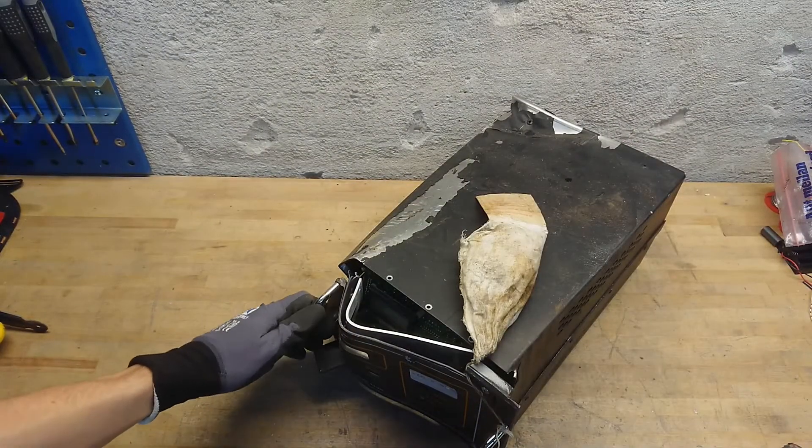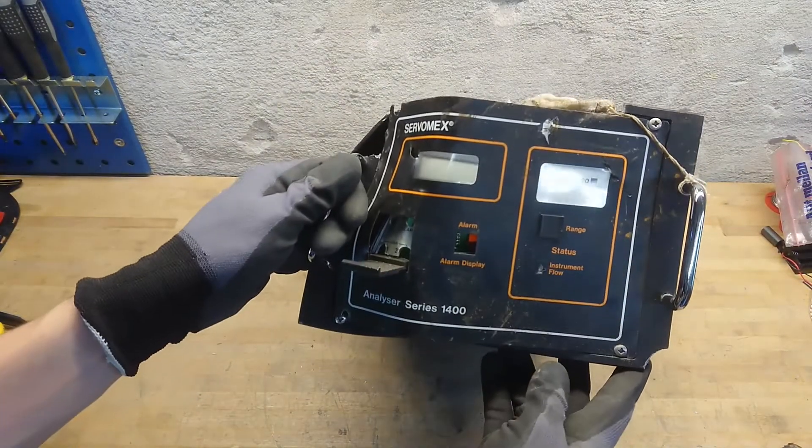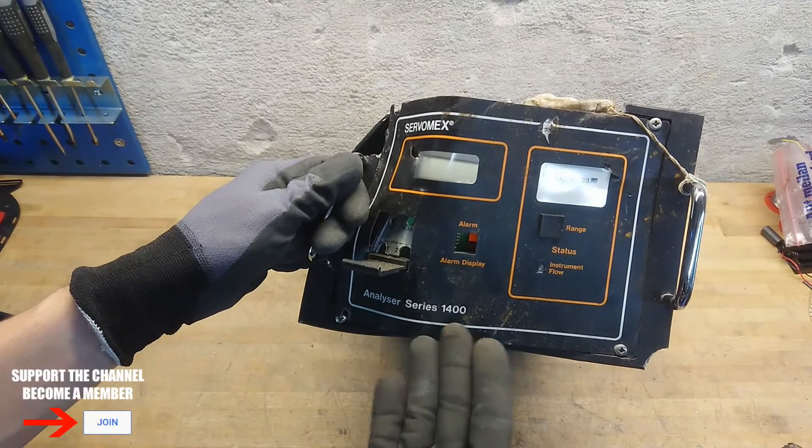MassBankup from Kaiser Power Electronics. Today, we're taking a look at this Servomex Analyzer Series 1400.